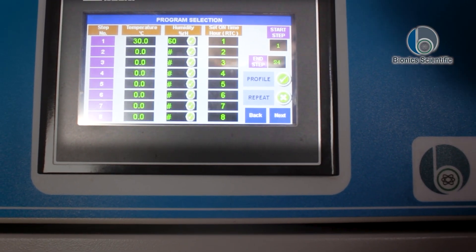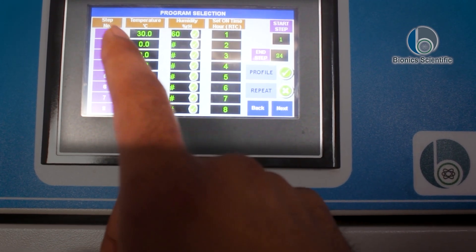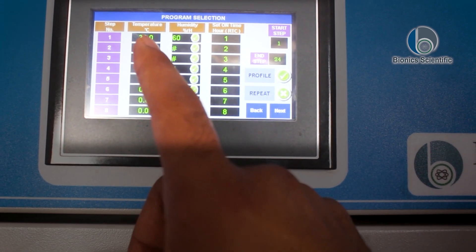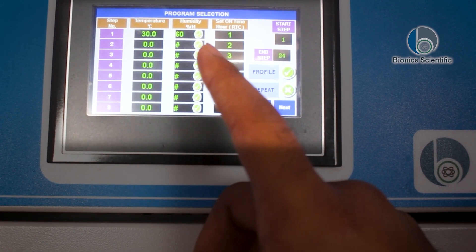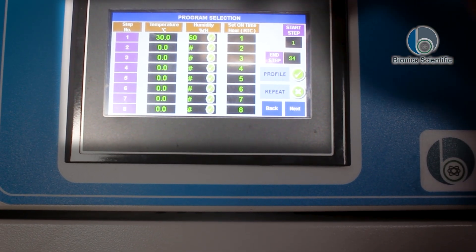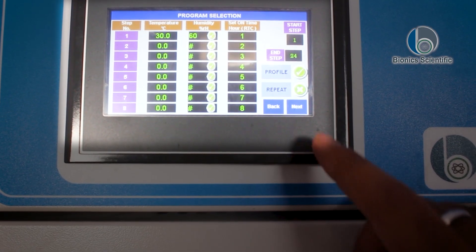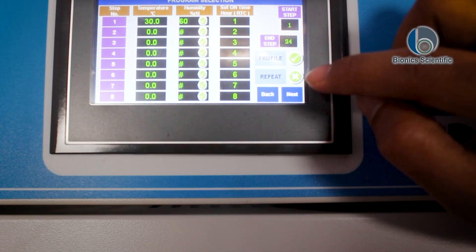You can see there are numerous cycles present over here. The first cycle contains a temperature of 30 degrees Celsius, humidity of 60, and the set on time uses RTC, which is shown here. You can tap next to proceed.